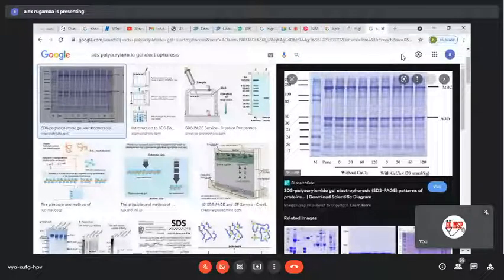It's a kind of protein which is a cancer suppressor. If you are measuring P53 after migration, the band will come here. You see 50 here? So the band will come here, around 50. And this band is showing that our sample, this sample number one, sample number two, sample number three, sample number four, has P53 protein. Okay? It's an example. P53 is an example.